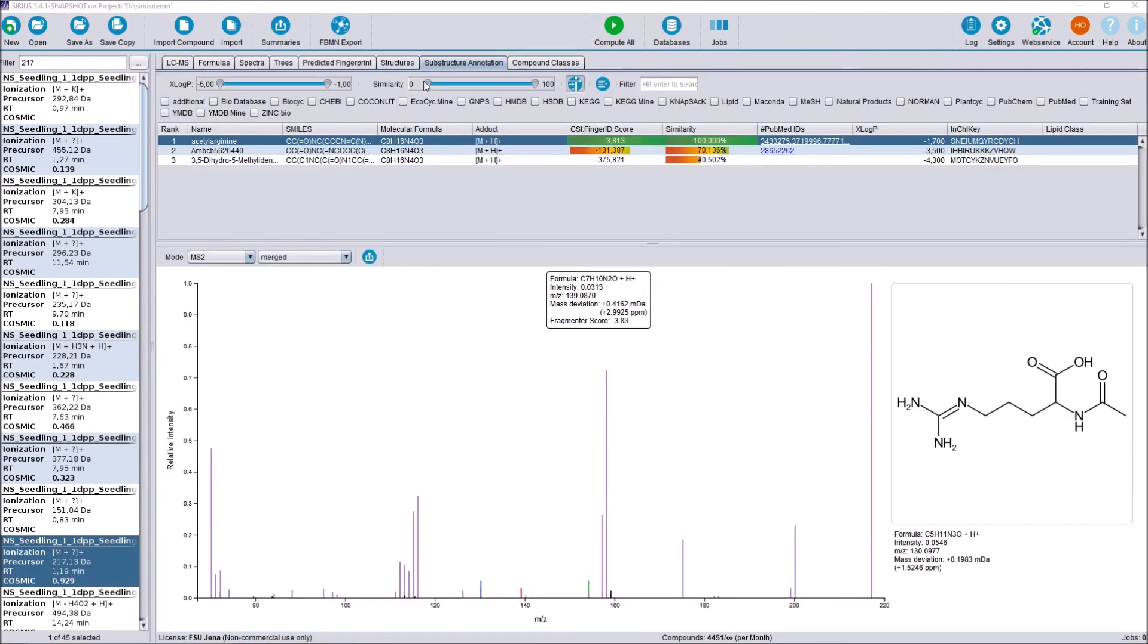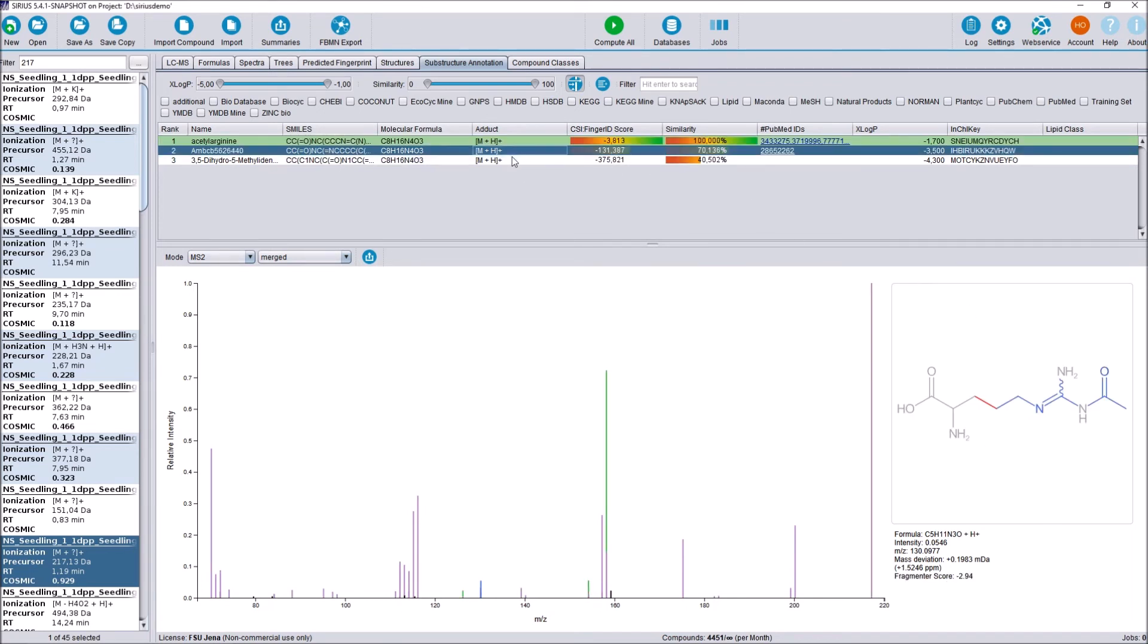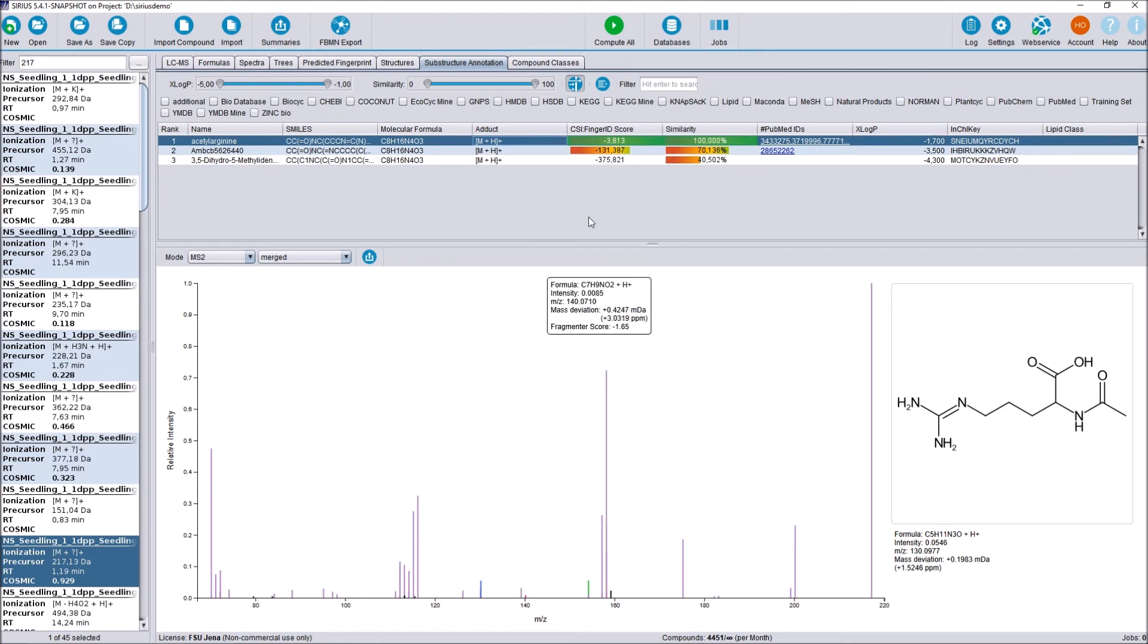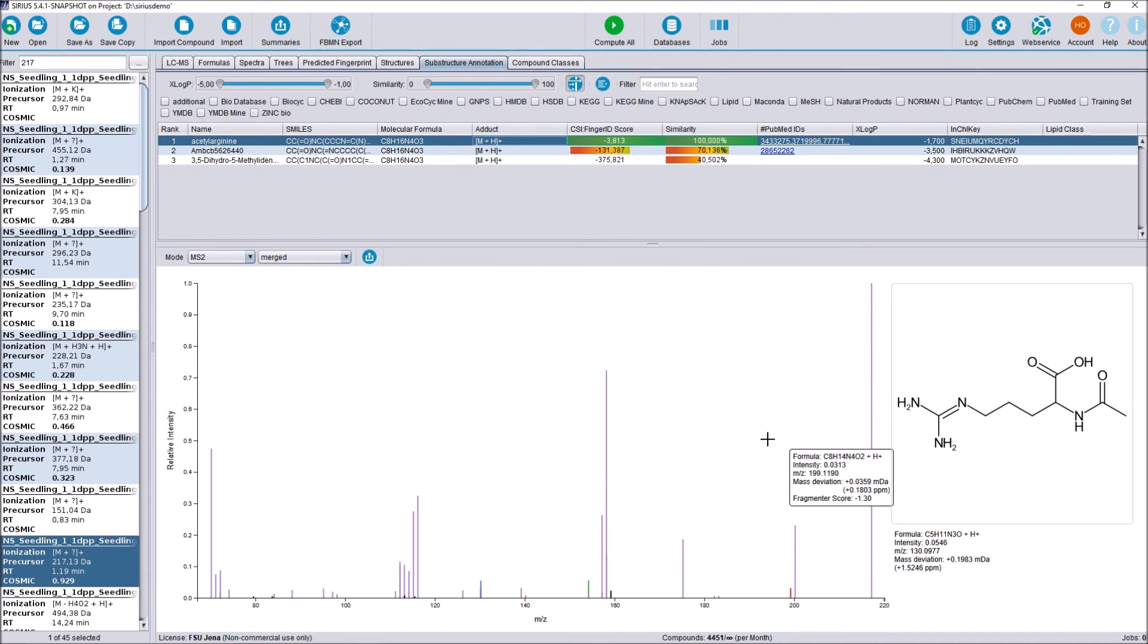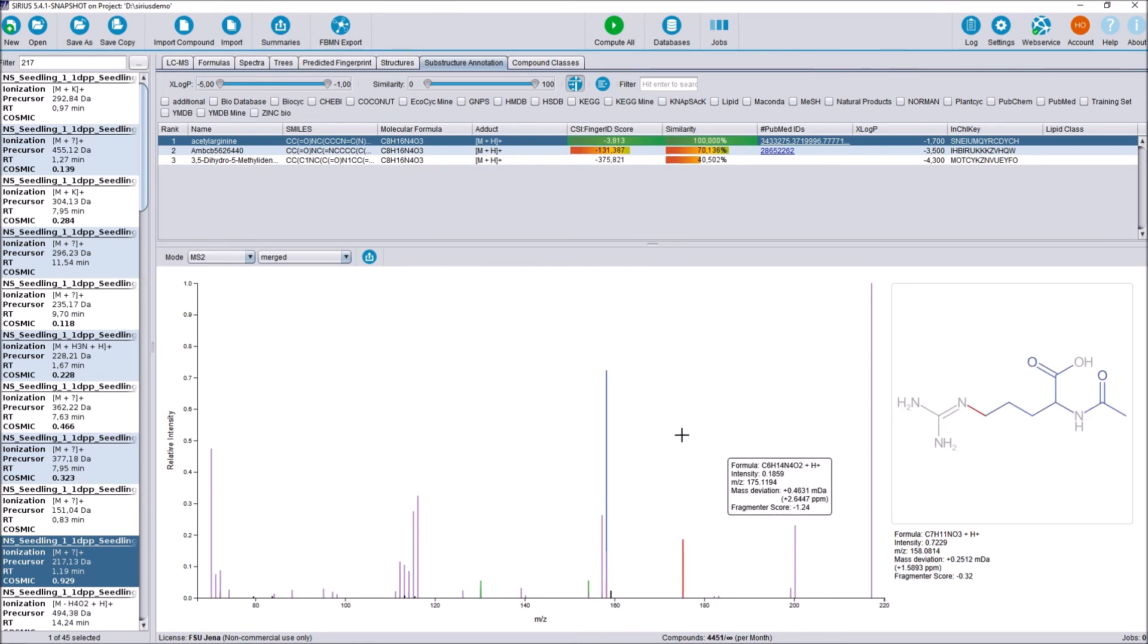Next is the substructure annotation tab, which brings a major functionality improvement. At the top part here, we see our usual ranked list of CSI structure candidates, just as in the old CSI FingerID overview tab that you are familiar with. And we also see a visualization of the structure that we are currently selected here on the bottom. What's new is that we are now able to get an idea of how well a structure annotation that CSI FingerID made, for example, our top hit here, matches back to our input spectra. For that, at the bottom here, we see our input spectra, and we see that peaks are marked in three different colors. There is a black peak, there are green peaks, and there are purple peaks.